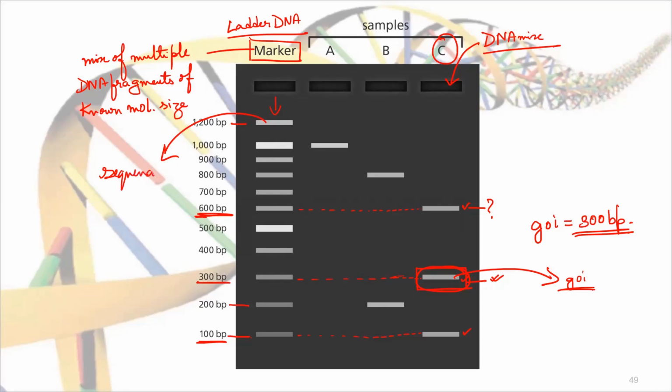When they did the sequencing, they found out how many base pairs are present in these bands and which base pairs they are. Now we could have done the same for our DNA mixture also, but that would become very cumbersome, more time consuming and more costly. So based upon something which is already done and known, we are carrying out an easier technique. That is why we call these things applications.